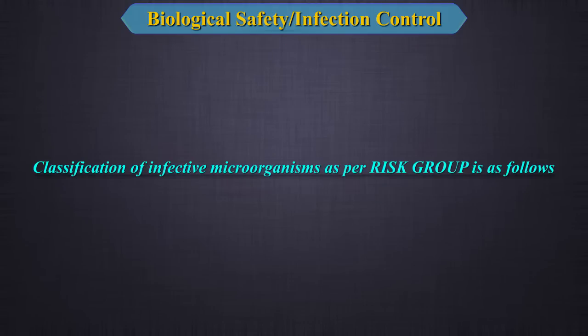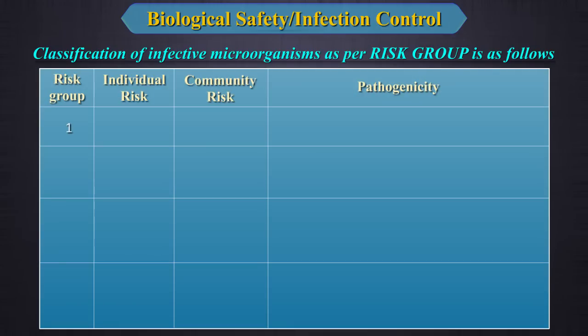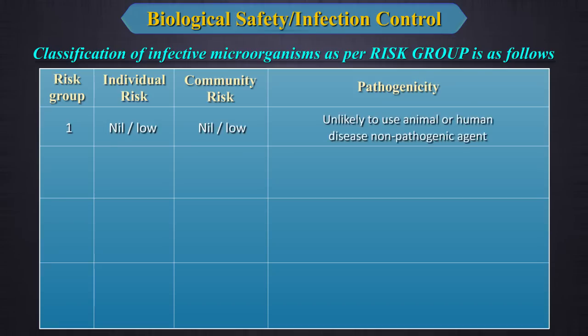As we can see in the table, Risk Group 1 is where the individual risk is nil or very low and the community risk is also nil to low. The pathogenicity here is that it is unlikely to cause animal or human disease — it is a non-pathogenic agent.